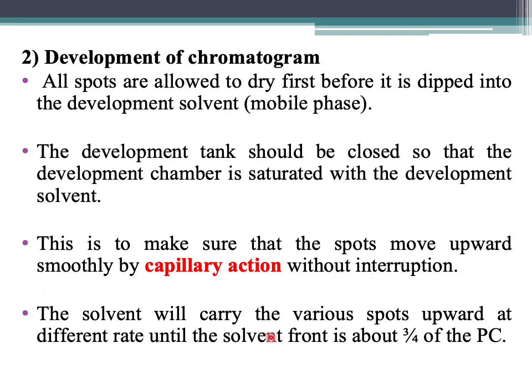The solvent will carry the various spots upwards at different rates until the solvent front is about 3/4 of the paper chromatography. So we let it rise until about 3/4 of the paper.